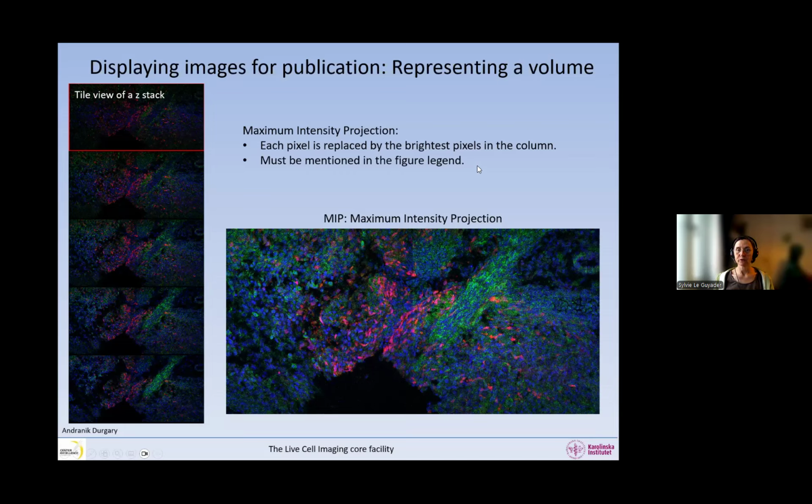Of course, if you display a maximum intensity projection in an article or even on the screen in a presentation, you have to say that it is a maximum intensity projection. And this works very, very well for a sample, for example, where you do not have things that are on top of each other in Z. So if you have an object here and another there, no problem. They will end up in the maximum intensity projection, both of them showing in a sharp way.